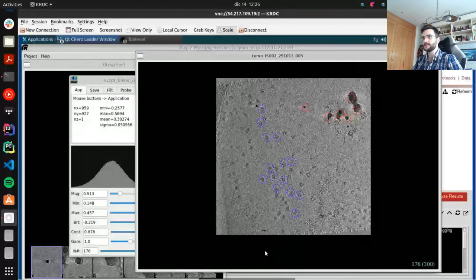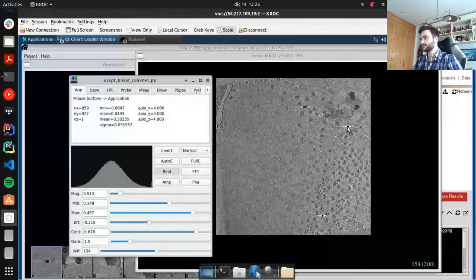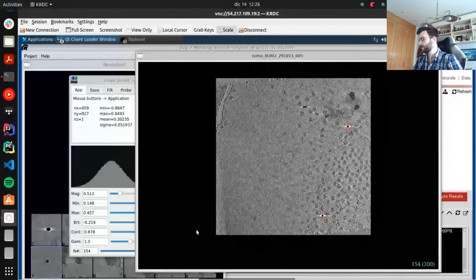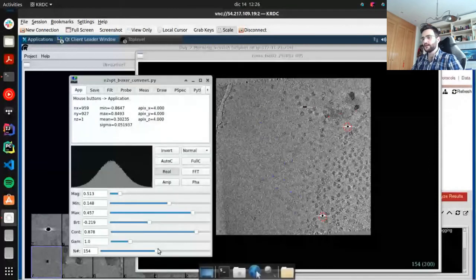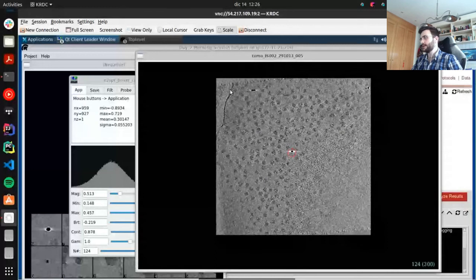And I'm going to change slice and search for other gold beads. We have some here, some here, seems fine. Also, I'm going to pick this membrane. This is just very orientative, as long as you pick the ones that you like. Also, do not place particles too close. Try to leave some space between the circles, because this circle size is kind of the distance threshold. So if you put particles on top of each other, probably the network won't train that well, okay?